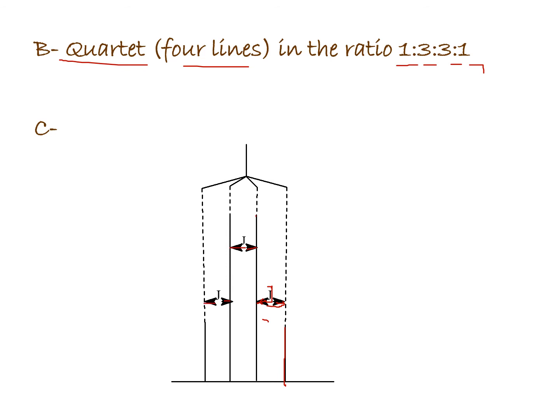And to measure the signal, delta will be in the middle. This is delta for this peak.